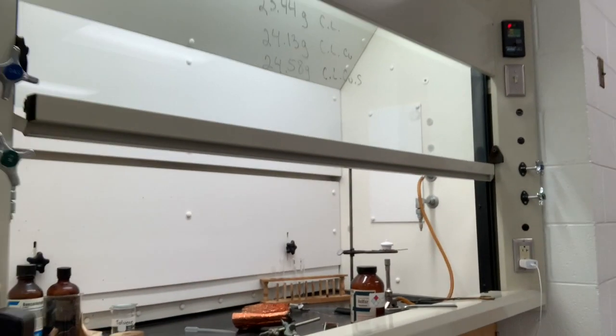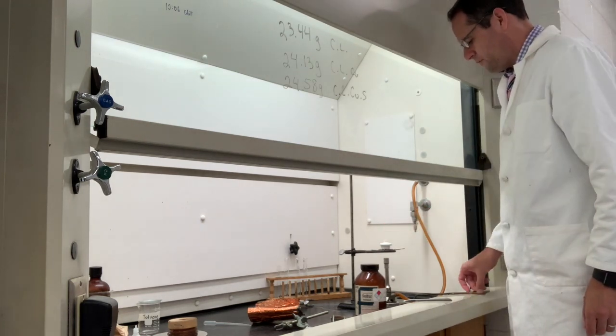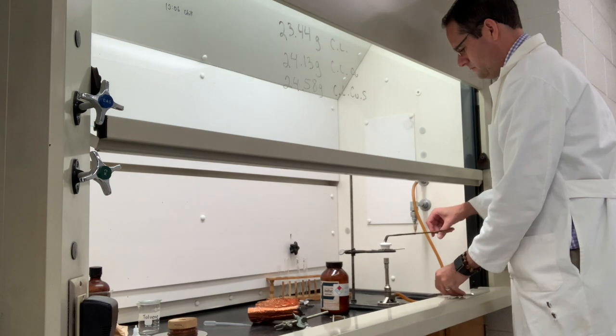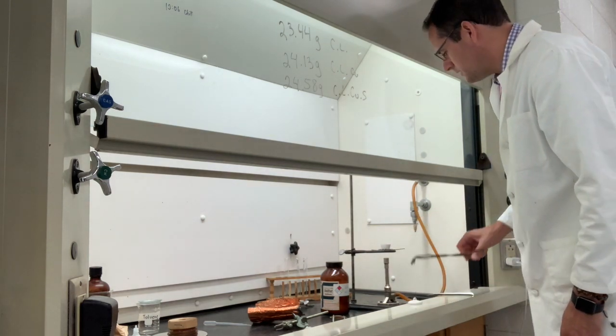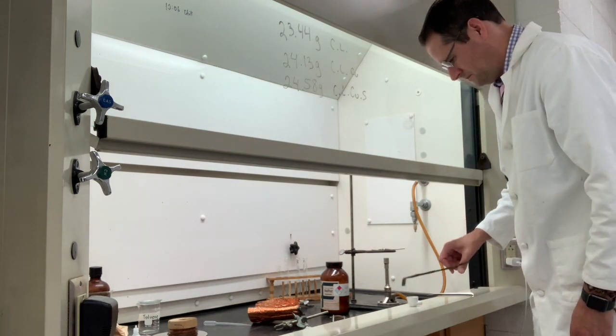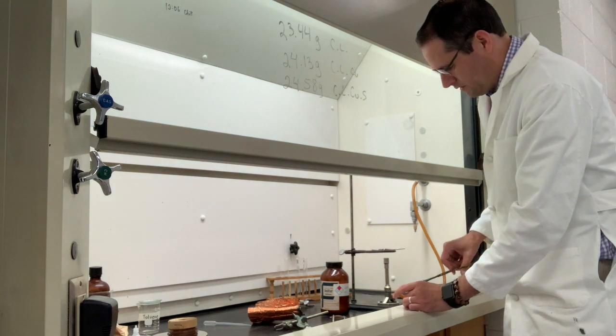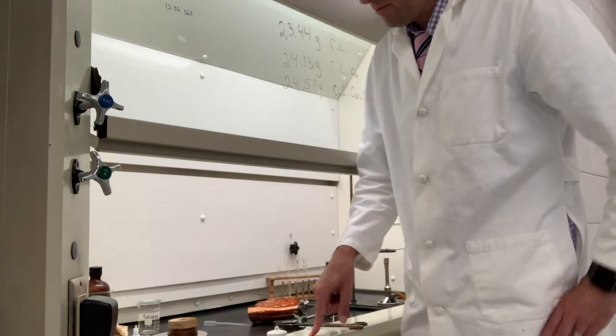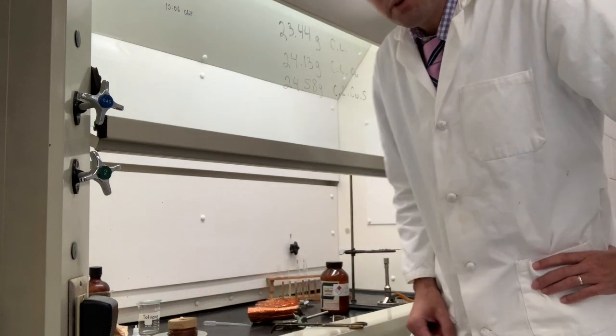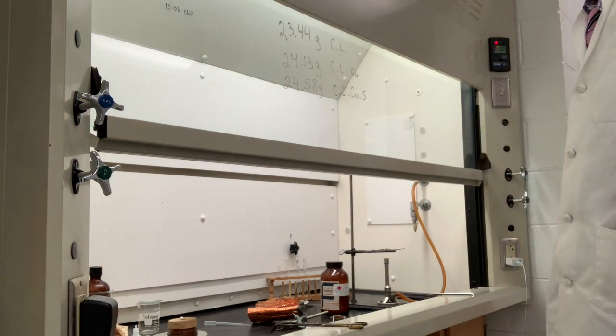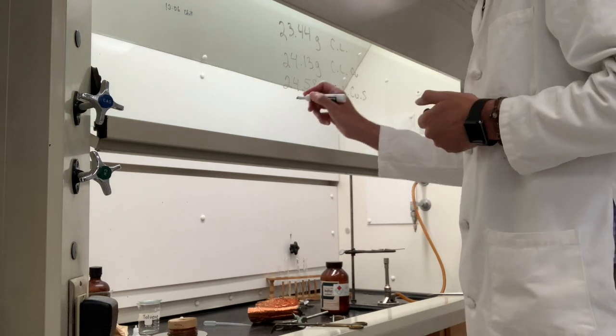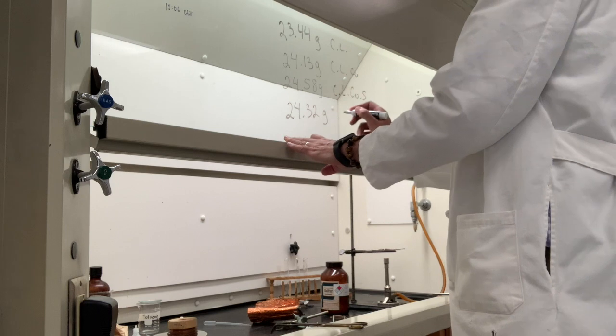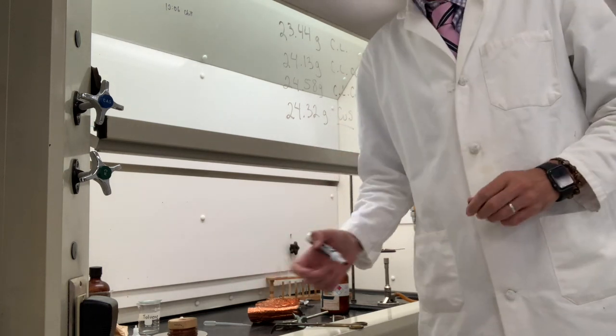Now that we have this crucible sufficiently cooled to room temperature, we can safely handle it. And we'll go ahead and measure the mass here. The iron can still be pretty hot, but the crucible should be okay. There's no more sulfur on the lid or in there. I'm going to hold this with my hands, which is not the best thing to do because that might transfer fingerprints to it, cause it to be erroneously high in weight. So that's the mass of copper sulfide. Whether it's copper(I) sulfide or copper(II) sulfide, we have to now calculate.